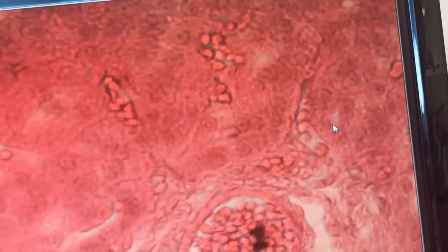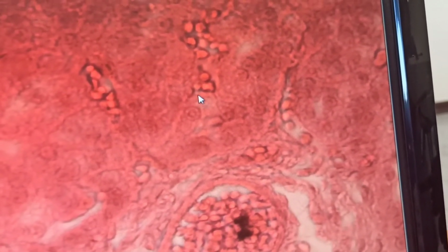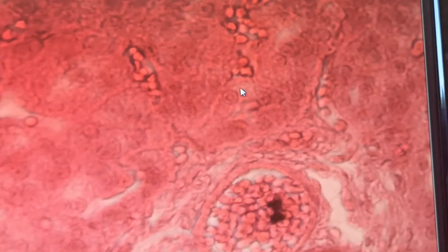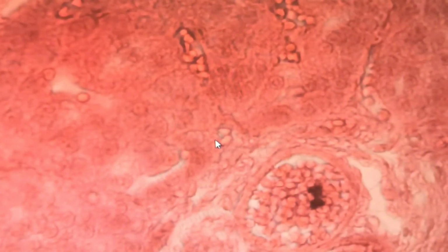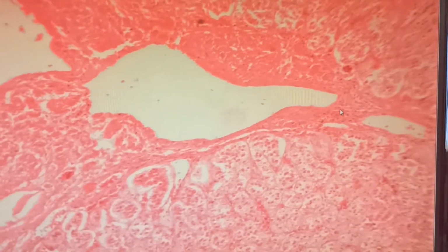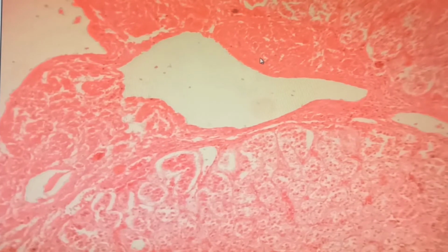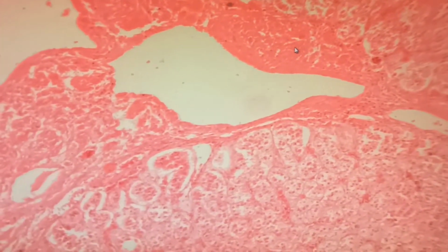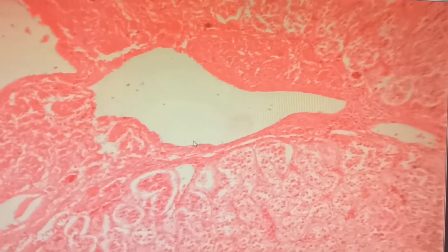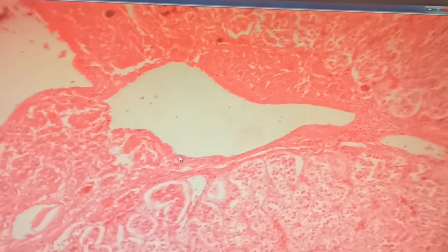These cells around these vessels, we call these cells what? Chromaffin cells. Okay? These cells are chromaffin cells. Actually, you can see the muscle cells around its wall. And whatever we see around the central vein is related to chromaffin cells. Okay? That is about the adrenal gland.